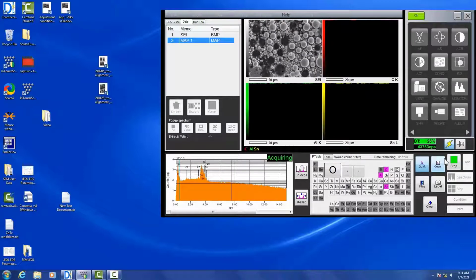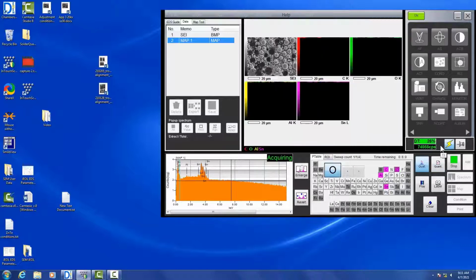And as you'll see, it's going to self-identify the first three elements again, and now it's going to break them up into different colors. It'll have separate colors for those, and now you'll be able to actually see the distribution according to the image that you took.